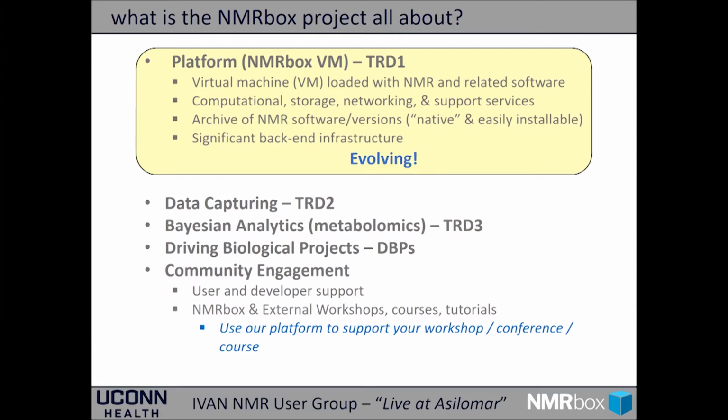A fairly large number of people are even using NMRbox in their coursework, where their students are using NMRbox in their classes.